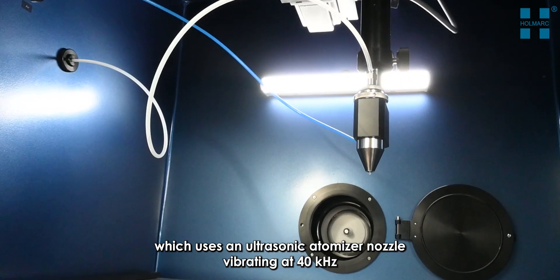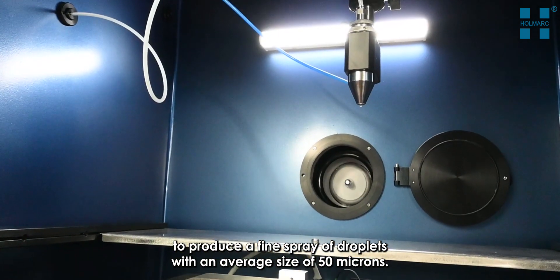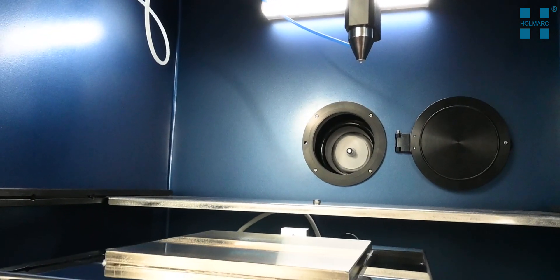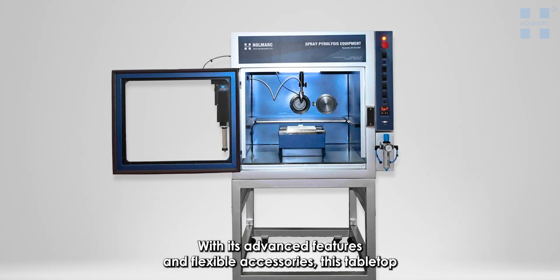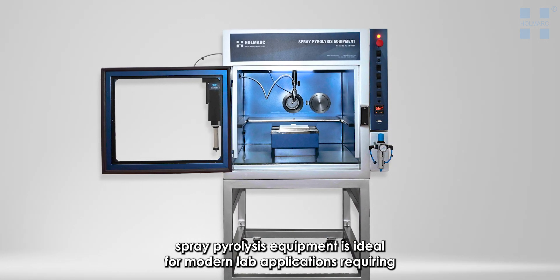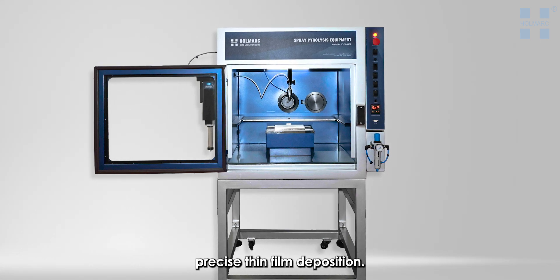Another optional accessory is an ultrasonic spray head, which uses an ultrasonic atomizer nozzle vibrating at 40 kilohertz to produce a fine spray of droplets with an average size of 50 microns. With its advanced features and flexible accessories, this tabletop spray pyrolysis equipment is ideal for modern lab applications requiring precise thin film deposition.